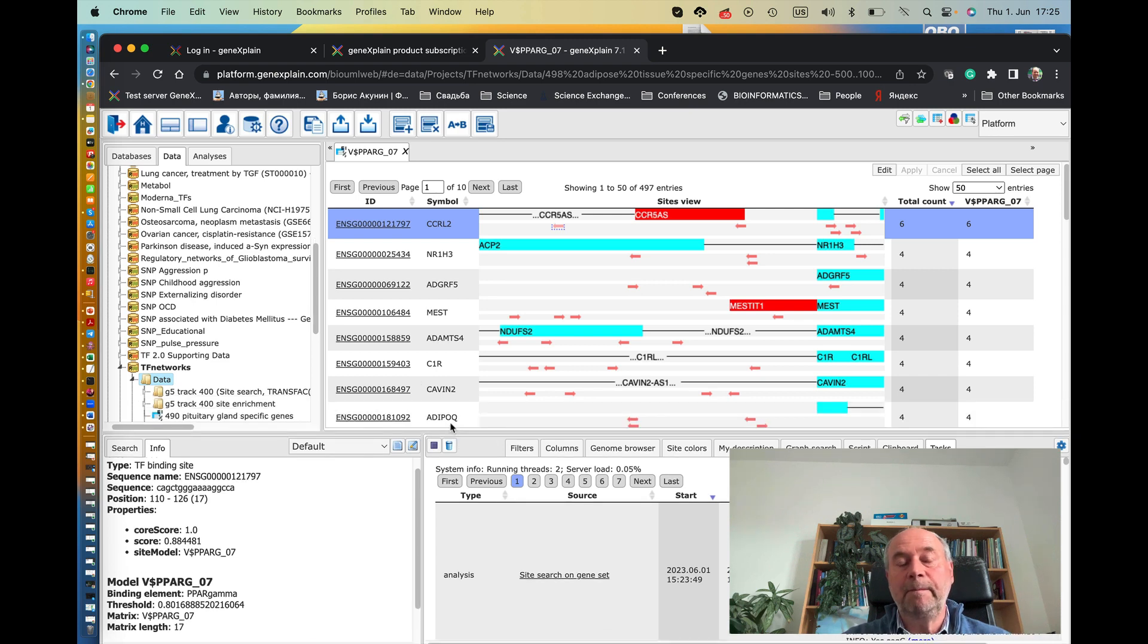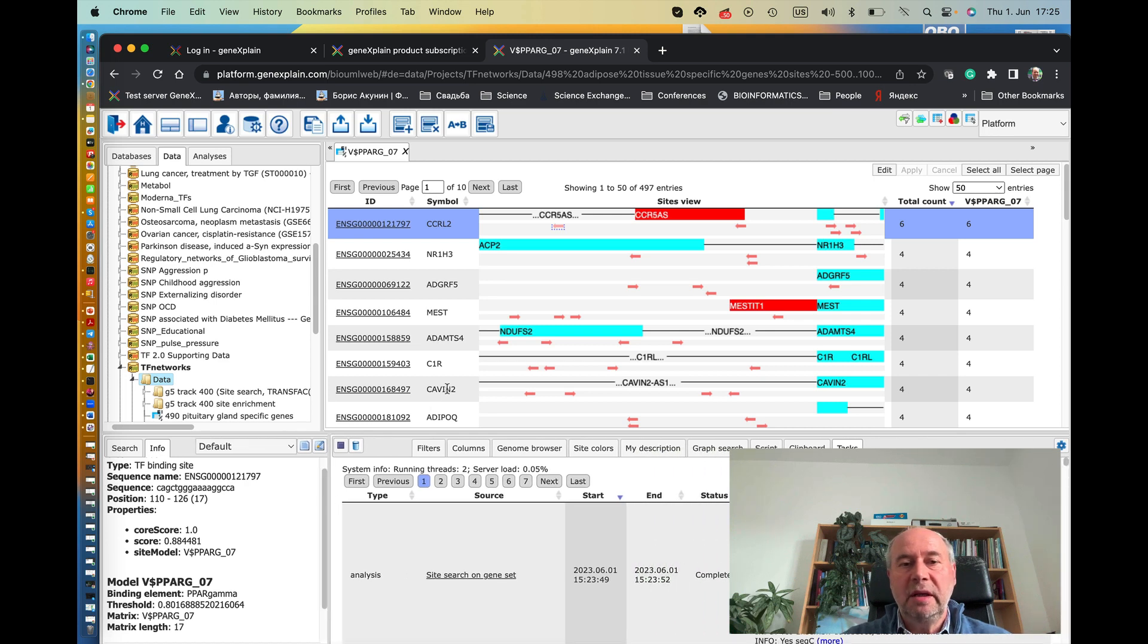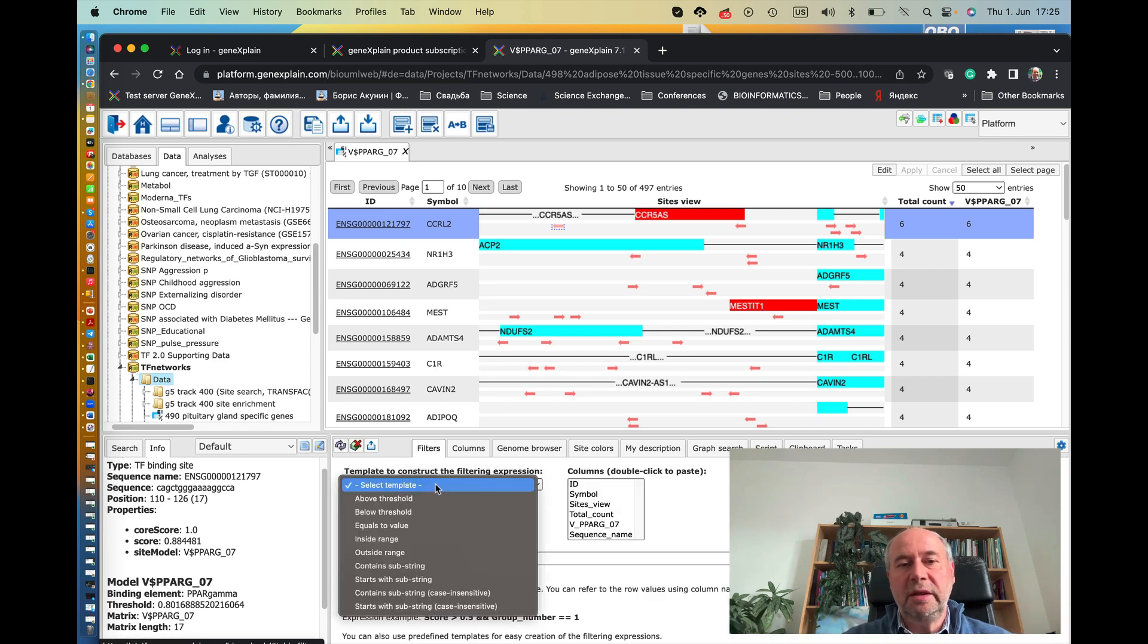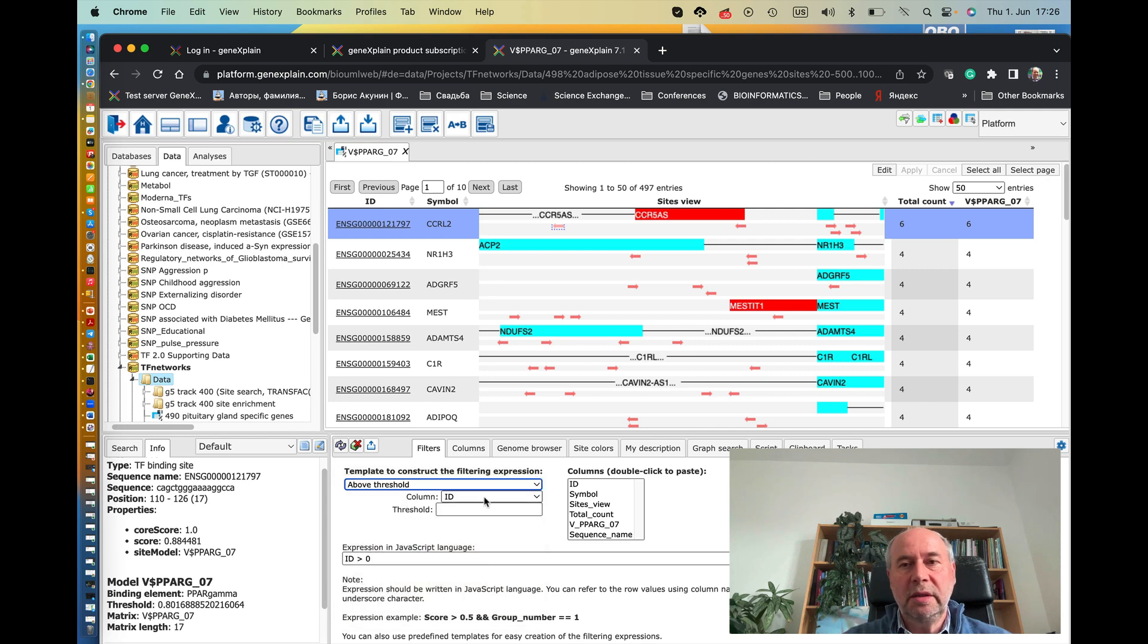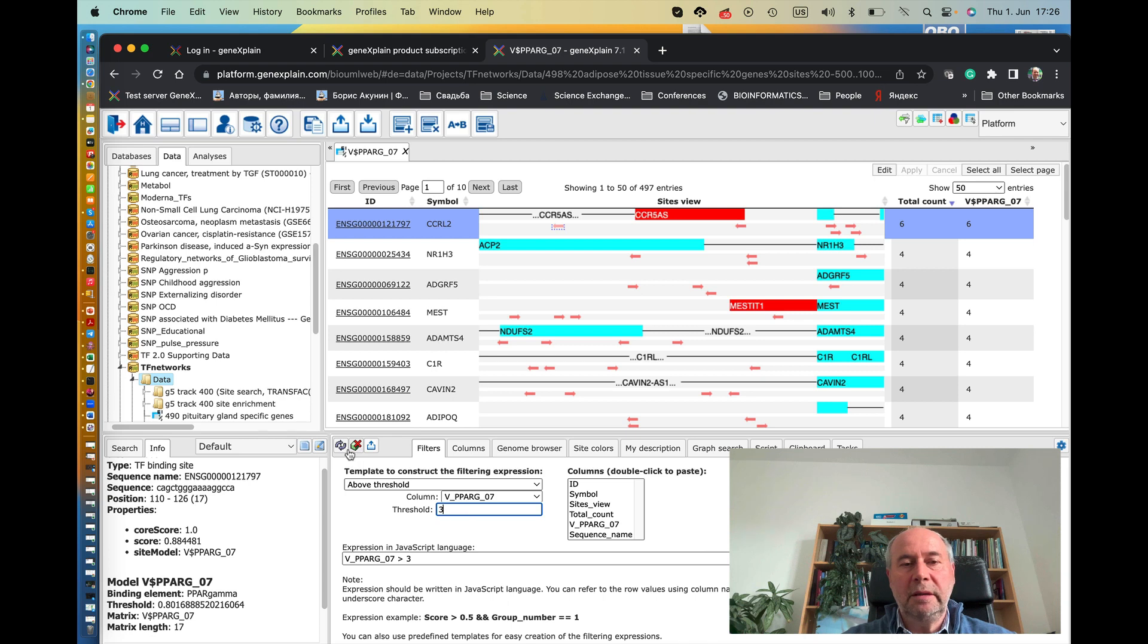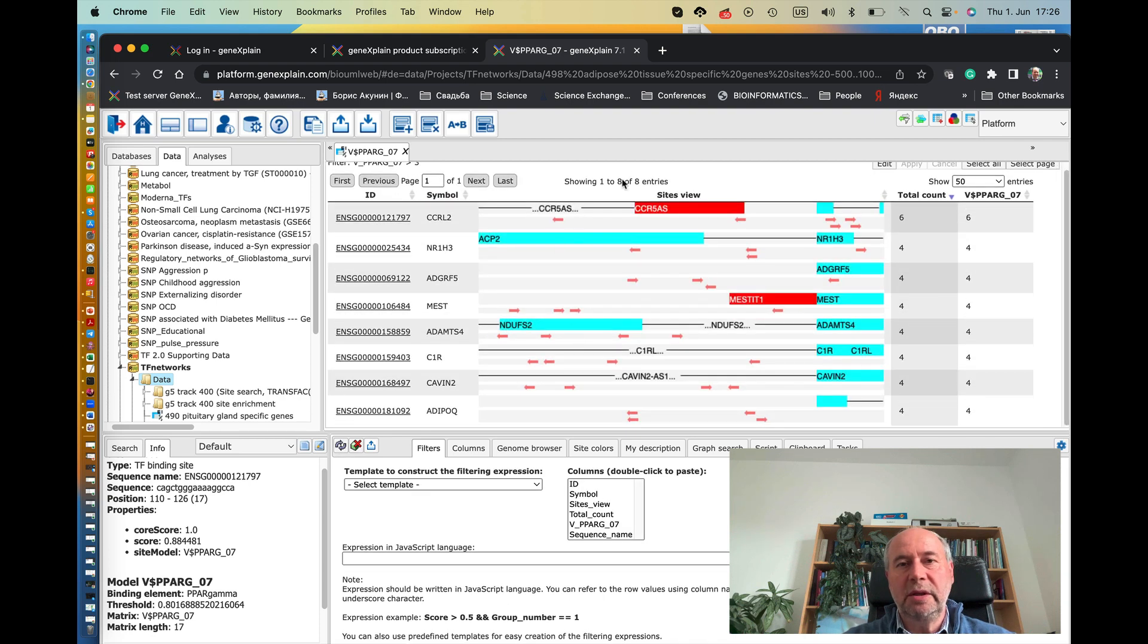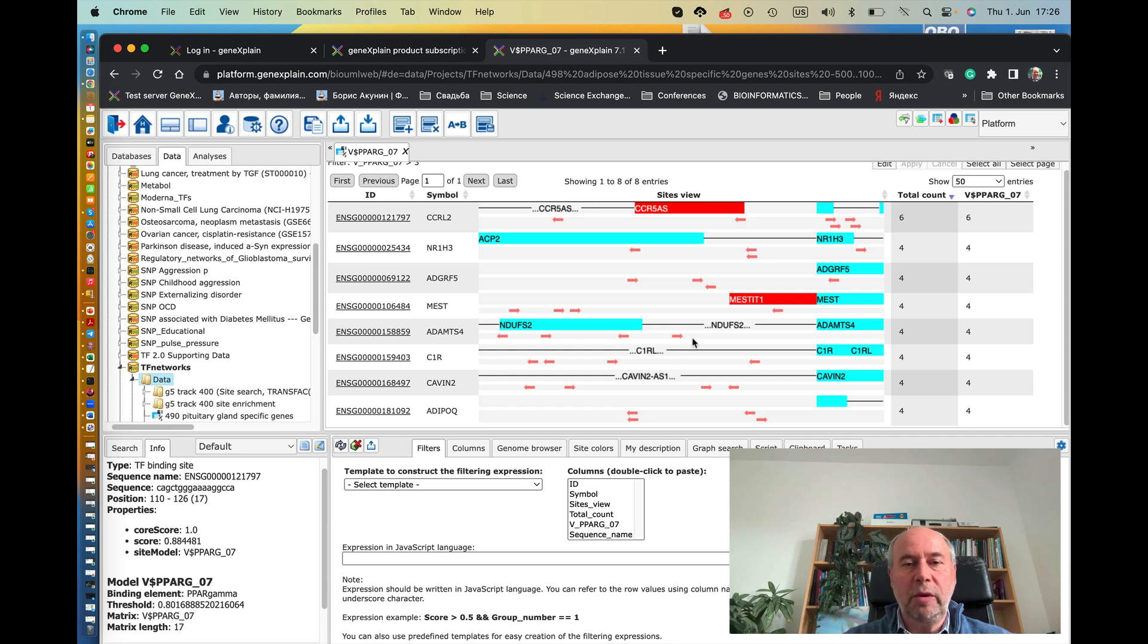Actually, you can select which genes have a maximum number of sites. For instance, we can put a filter saying I need only those genes which have at least a number of found sites more than, say, three. So we put here above threshold and then we select the number of sites with PPAR gamma, so more than three. And then we apply this filter, and now we see actually four genes which have so many binding sites in their promoters for PPAR gamma. So these are indeed the genes which must be regulated by PPAR gamma because they have so many binding sites in their promoters.